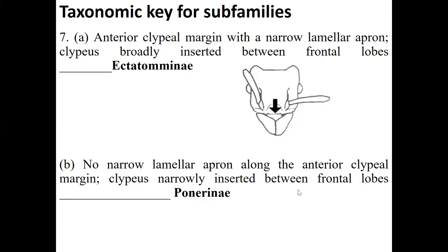But narrowly inserted means it's narrow. You don't find this sort of wide or broad area, but you see a very narrow region here, very narrow clypeus.